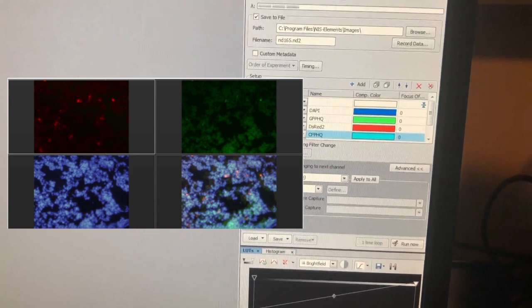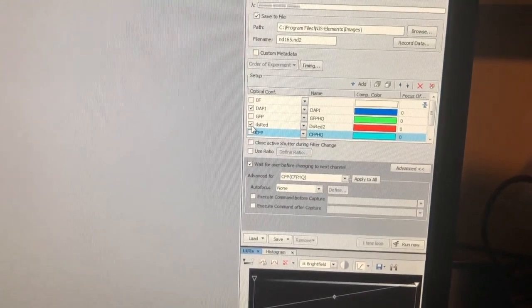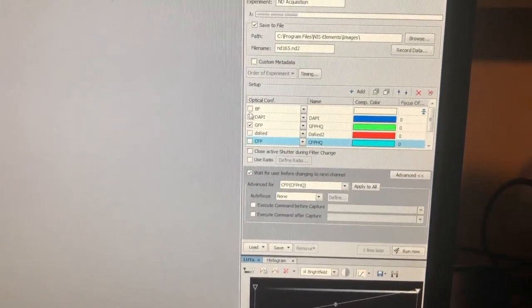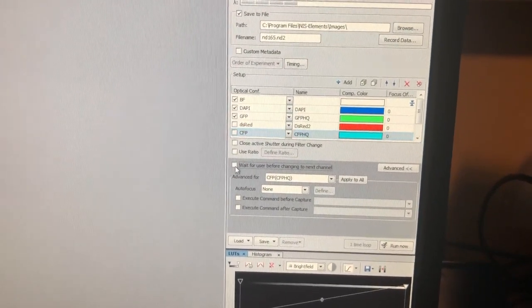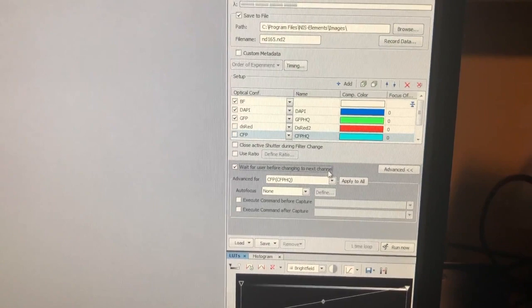Your sample may be labeled with more than one fluorophore staining different subcellular structures. An overlay image allows you to observe the localization of these stains simultaneously. To take an overlaid image, follow these steps. In the Capture Multi-Channel panel, select the boxes for all channels of interest. Our sample contains DAPI and GFP. Then check the box titled Wait for User before changing to next channel. Then click Run Now.